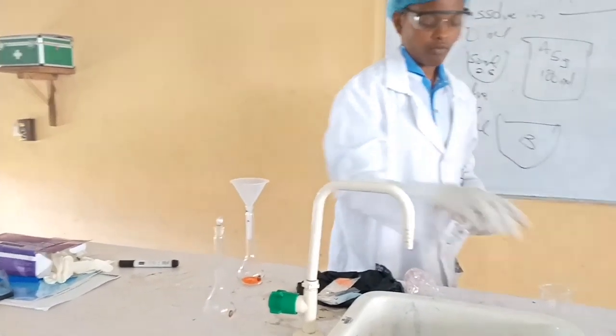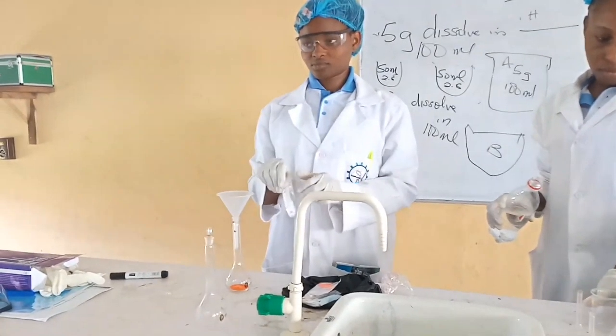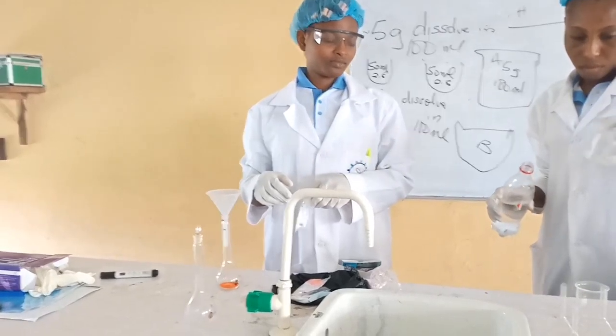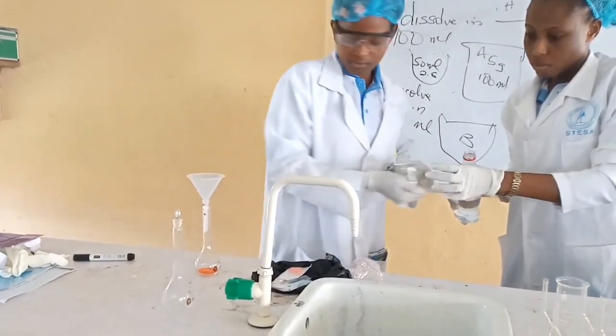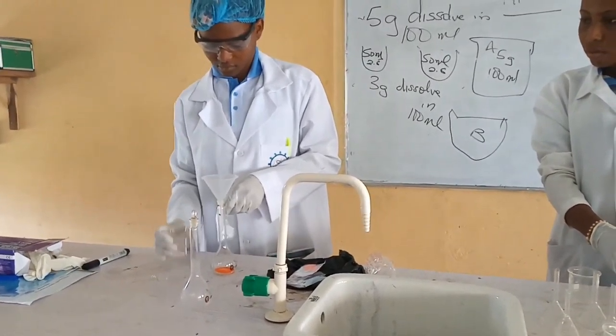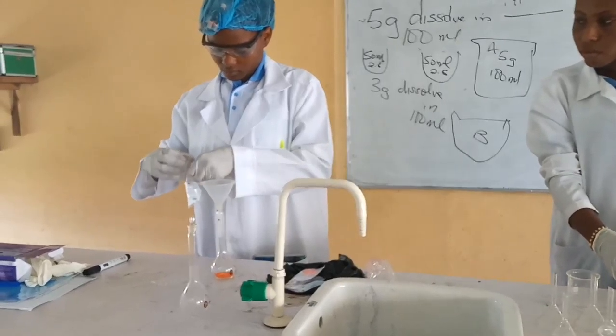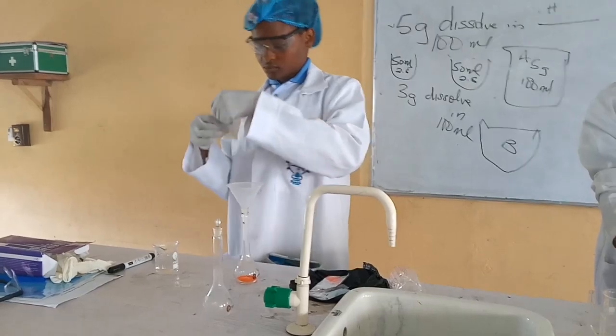So what she does is she puts the powder through the funnel. Why is she using the funnel? Because if you want to do that without one, one or two grains will fall. So you now start picking it and putting it back. Funnels are useful though. So that's why that funnel is good. Most of us in our kitchen, you don't use a big funnel, and your hand is not even very steady.